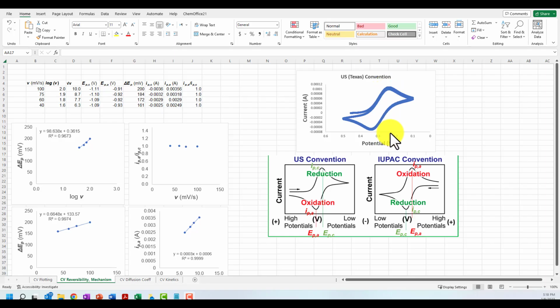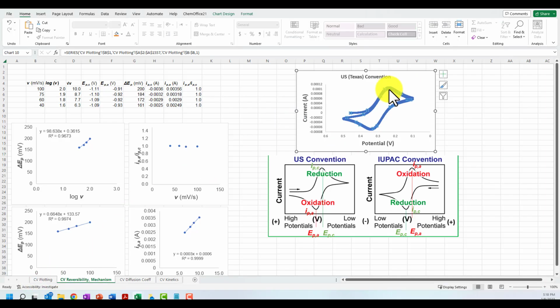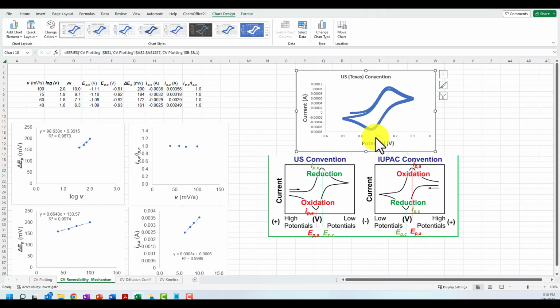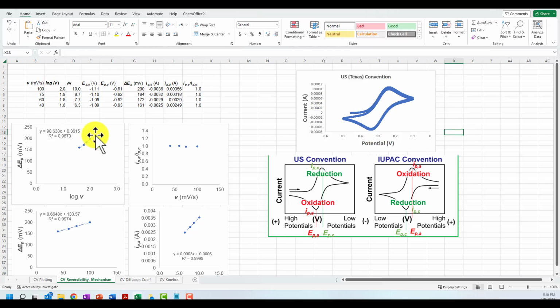So you would go down here, find where this is the inflection points at a maximum. You can do that just by looking directly on this and clicking on the value here to find out what it is. Or you can look at the original data set and find where it goes to a maximum or a minimum. Either one of those would work sufficiently. Then you'll plug them in here.